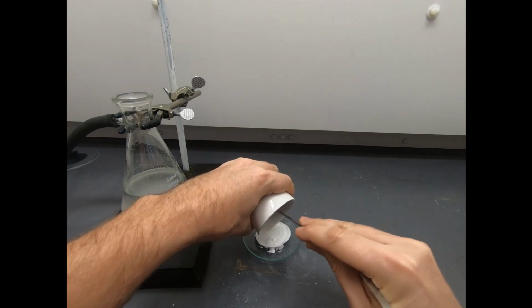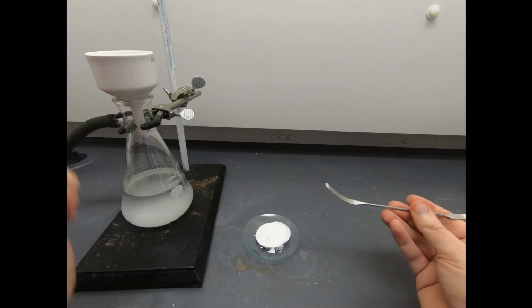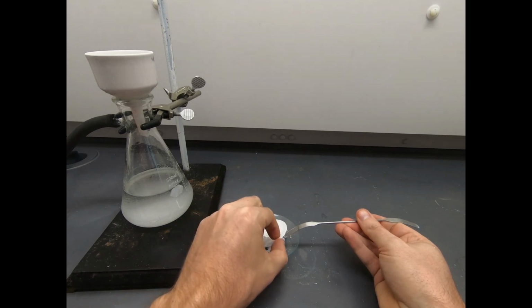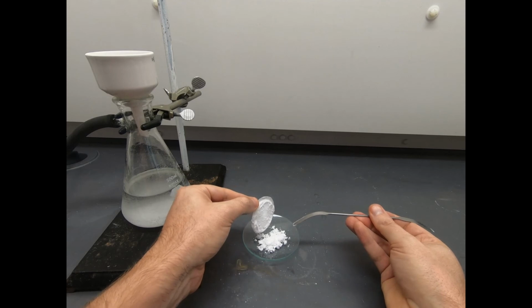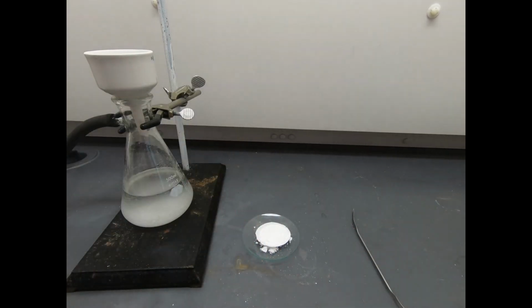a significant amount of material. You're never going to be perfect. It just has to be good enough. So there's our product. You can see a lot of it's adhering to the other side of the filter paper. That's fine. We'll just let all that sit out and air dry. And once that's dry, I'll get that material off the filter paper and get a mass of just the watch glass and the solid, and that'll give us a mass of the product.